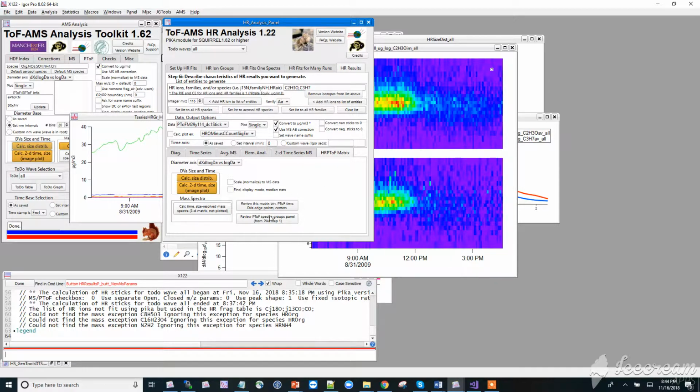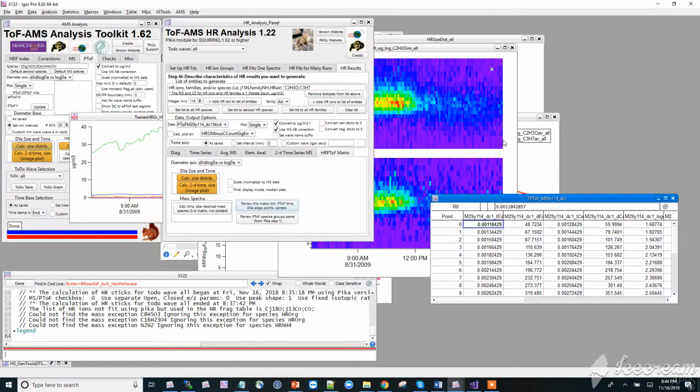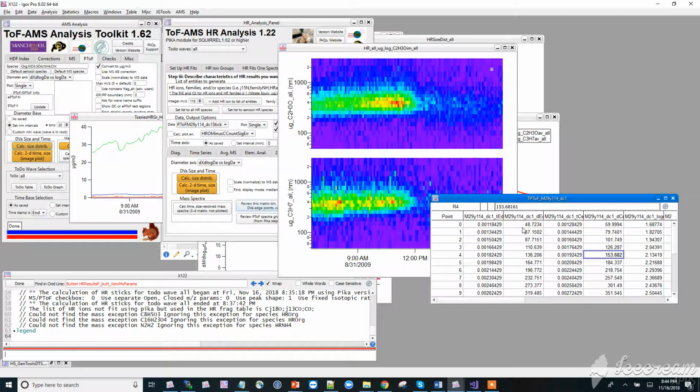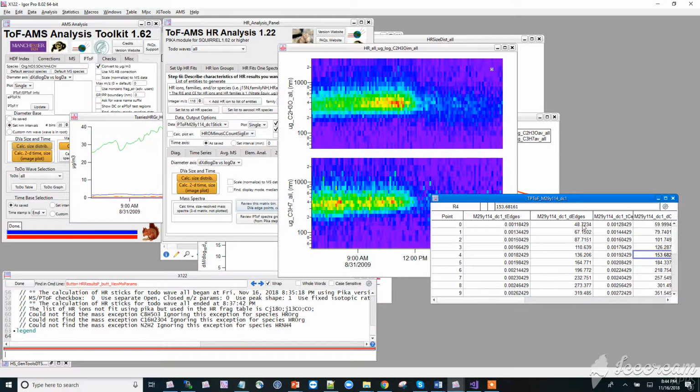There's a couple other features you will want to use. One is this review bin time. As you're looking at some of these PToF bins at different sizes, you may want to know the different time in PToF time that it corresponds to, or the diameter. So now this is the diameter of the very first bin corresponding to here in nanometers. So this one is going from 48 to about 67 nanometers, and the next one 67 to 87, and so on and so forth.